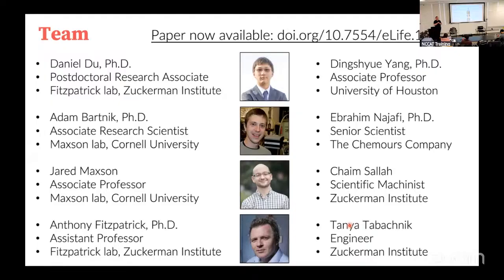Number one, you have to pass the electron beam into the path of the focused laser beam. So you can't move it, right? So you're going to have to bring the electron beam down. And then I think from the latest presentation I saw, they have to move the electron beam into the path of that laser. Now, when you do that, you are going to lose resolution because you are now asking the electron beam to do something it doesn't really want to do, right?